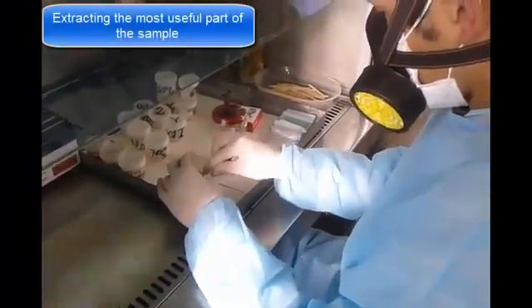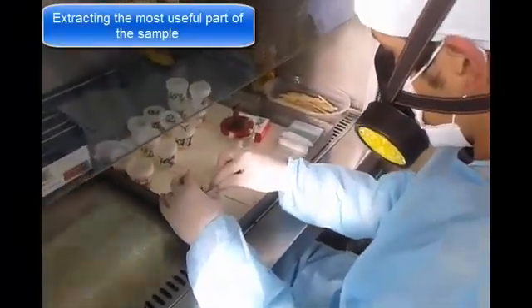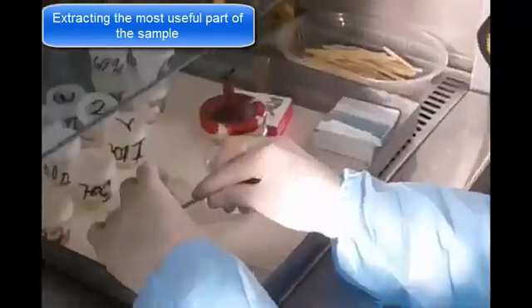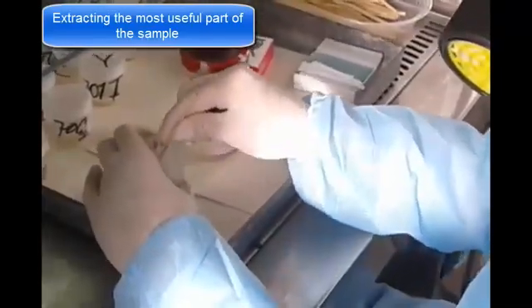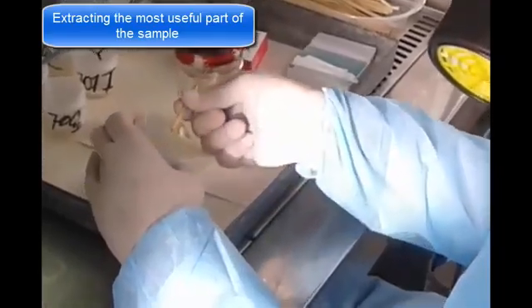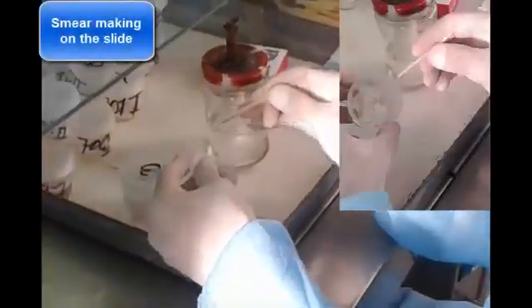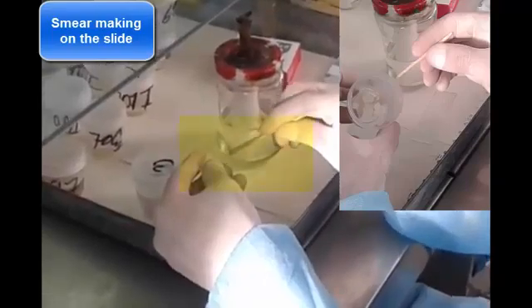First, after sterilizing this slide with the spirit lamp, we must extract the most useful parts of the sputum, which are the most purulent or bloody and purulent sections. This is the most important part of the process. In case of not making a thin uniform smear, we might not obtain bacilli stained, which could lead to a false negative diagnostic.